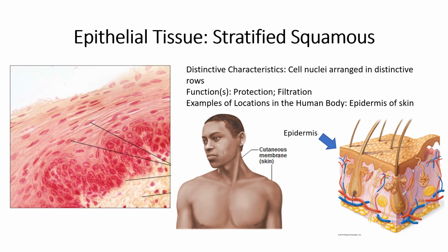Right? We'll talk about that later when we talk about the integumentary system. Once you get below the epithelial tissue, so all of the pink down here, not including where the hair follicles are, all of that is your dermis. The dermis is made up of connective tissue.